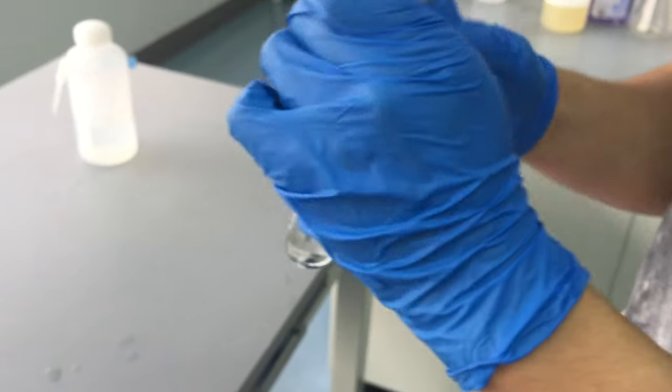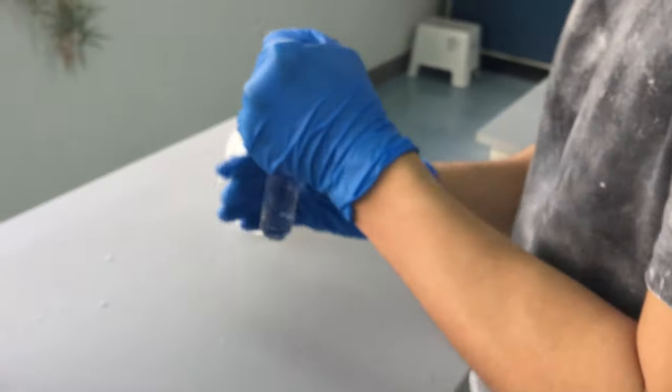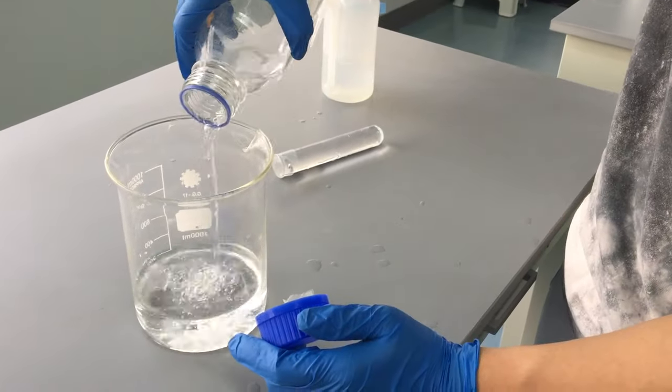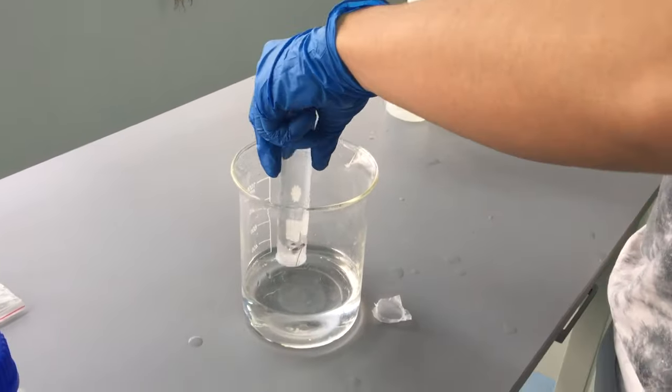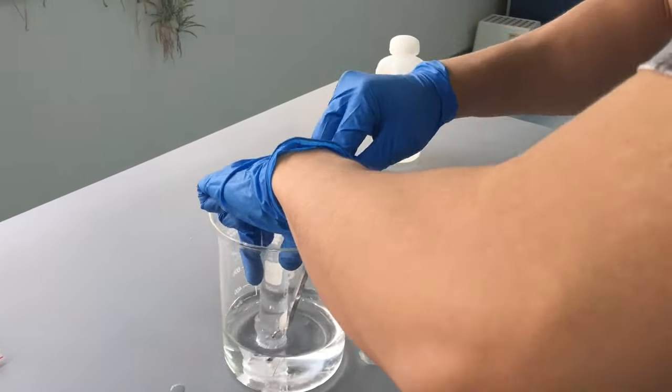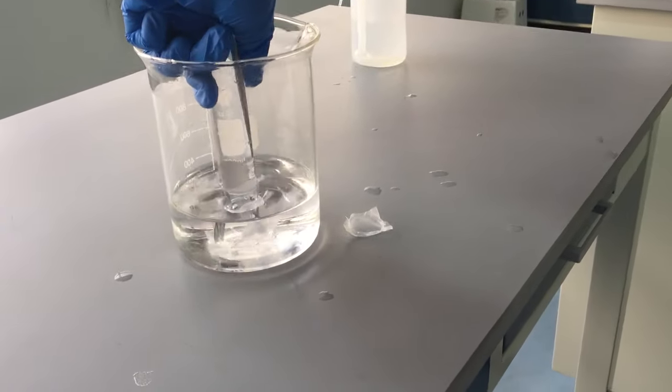Pour hydrochloric acid in the beaker. Invert the test tube into the hydrochloric acid and remove the parafilm so the hydrochloric acid can react with the magnesium.